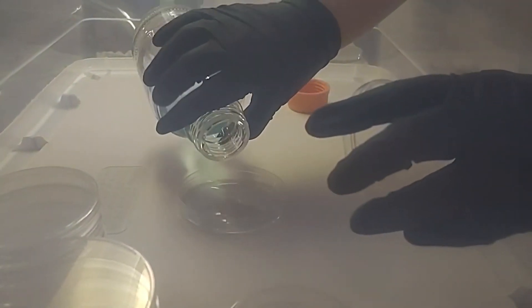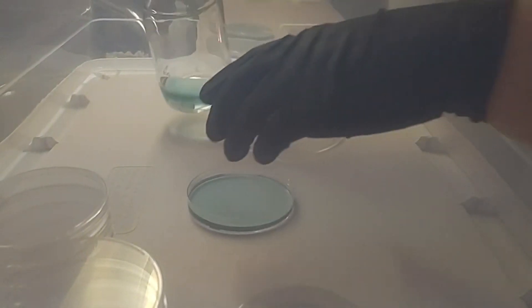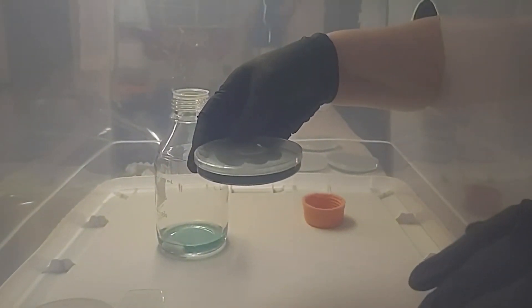In this video we are utilizing water agar to complete a spore-to-agar transfer. As previously mentioned, spores are inherently dirty, so using water agar without the nutrients and sugar will starve contaminants while allowing good mycelium to grow.